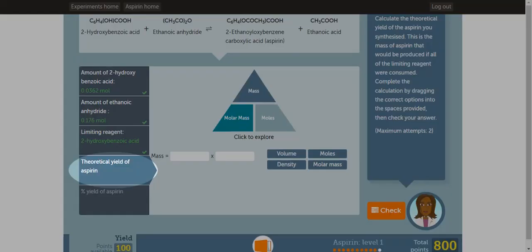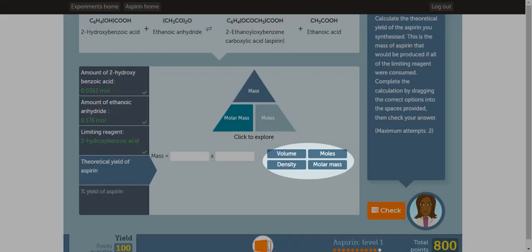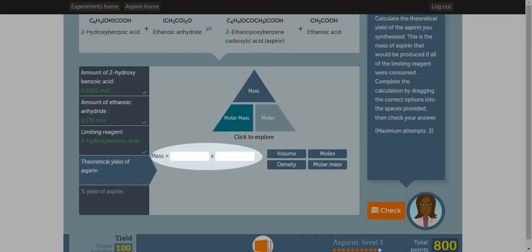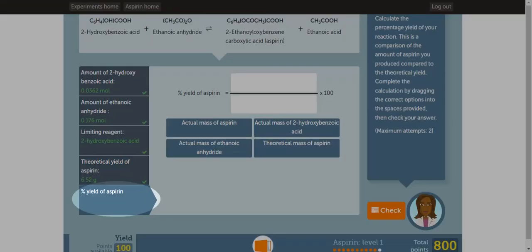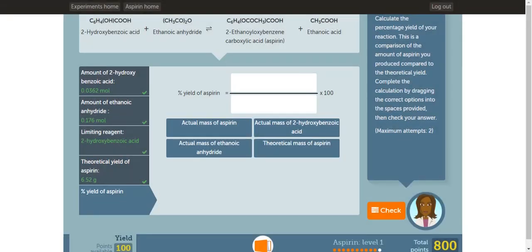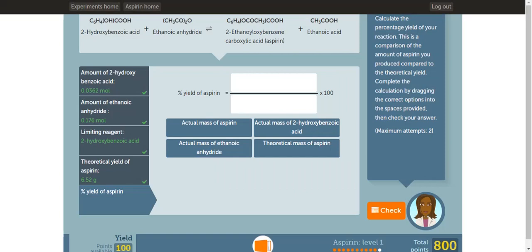In the fourth part of this activity, you have to figure out the theoretical yield of aspirin. To do that, you need to know the relationship between mass, moles, and molar mass to complete the equation. To complete the equation, drag these boxes into the equation. Once you're done, click check. For the last part in this activity, you have to determine the equation for the percent yield of aspirin. So drag these boxes into the equation and then once you're done, click check.